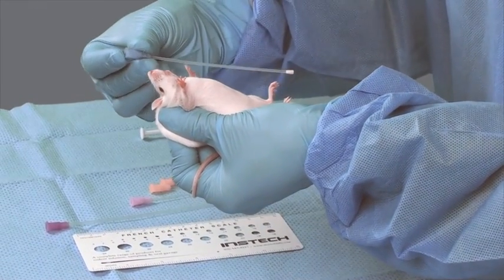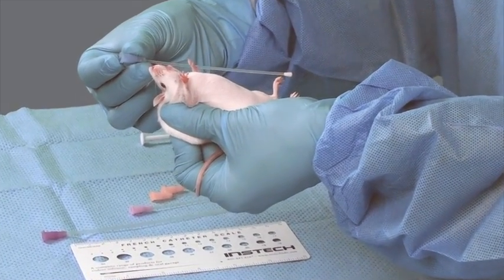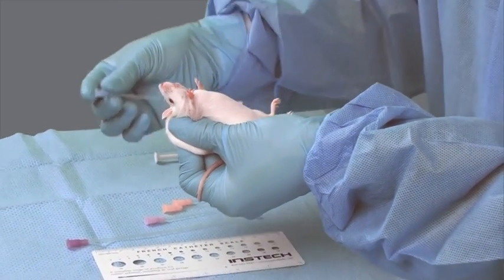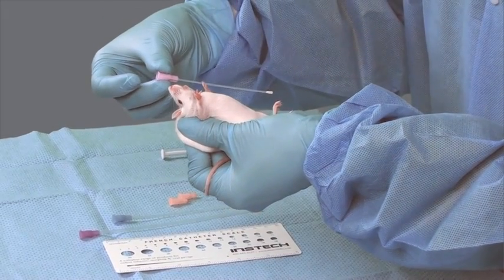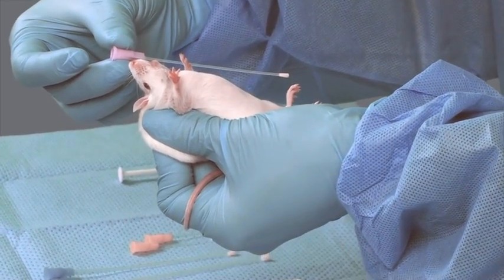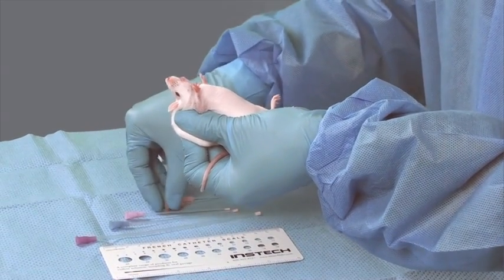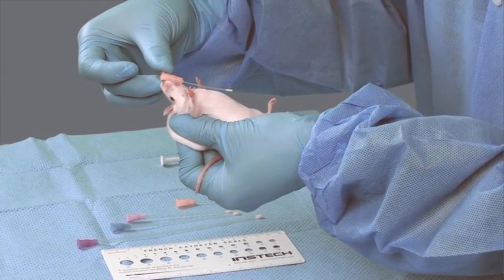The feeding tube should be the length of the mouth to the bottom of the sternum. If it is too short, contents could be aspirated. And if it is too long, the risk of perforation increases. The first two feeding tubes are too long. This last feeding tube is the appropriate size for this mouse.